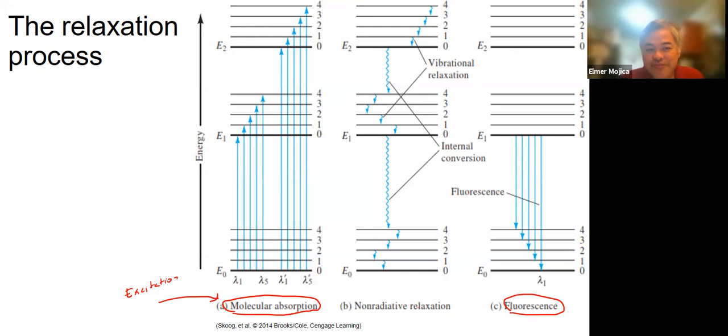So for dilute sample, you can use the Beer-Lambert law, like what we discussed last week. Okay, ano yung Beer-Lambert law na inaano natin yung formula? A is equals to ABC, di ba? Or we could put it like molecular absorptivity times the path length times the concentration of the thing.